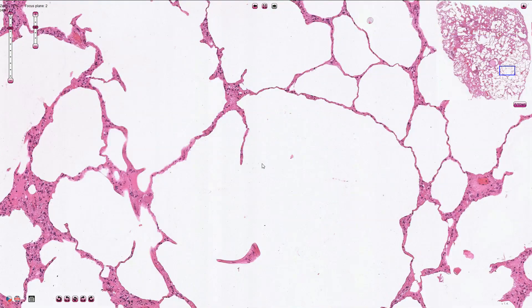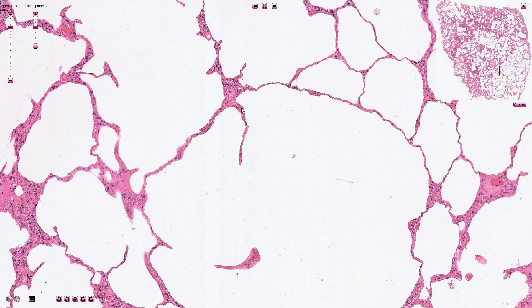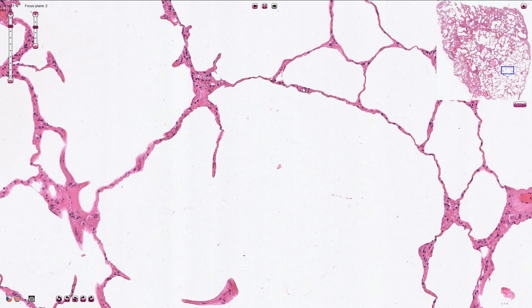On higher magnification, we can see that some of the alveolar septi are not interconnected and they end in free space. Some of these septi are extremely thin and are associated with loss of capillaries.